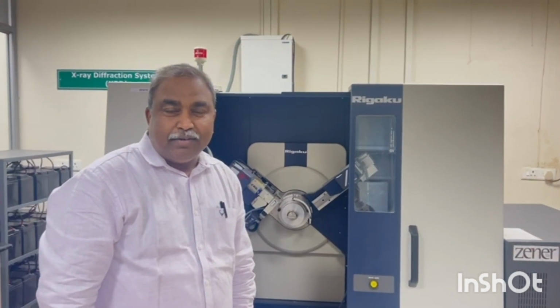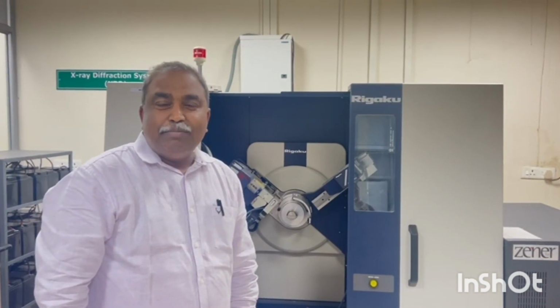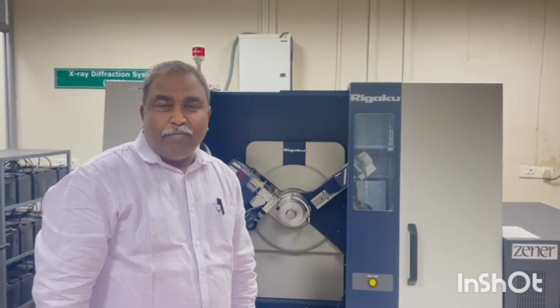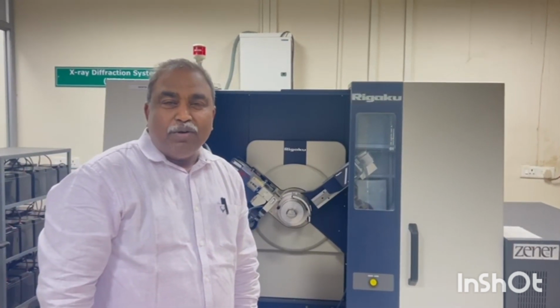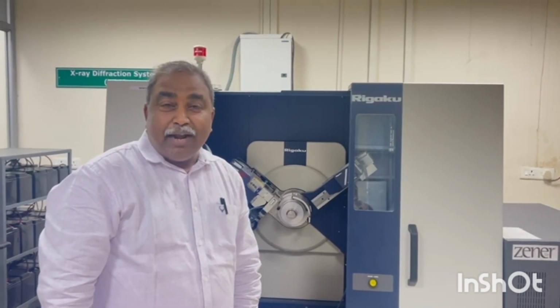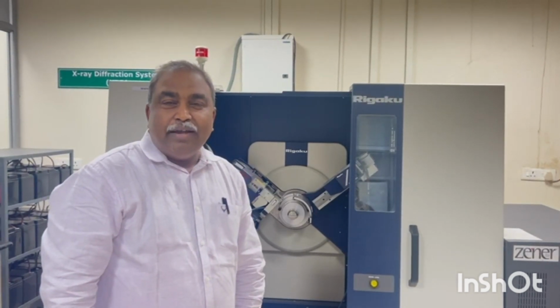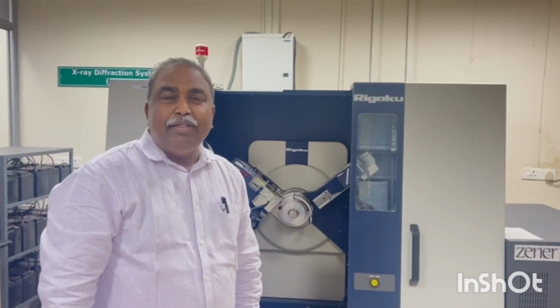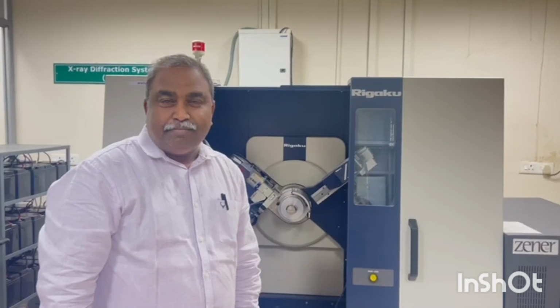of materials. What is D-spacing? D-spacing is nothing but the distance between two lattices in a molecule, which is unique to every molecule. So if you know the D-spacing, then you can identify what material it is. So XRD helps us to identify the D-spacing, based on which we can identify the crystalline materials.